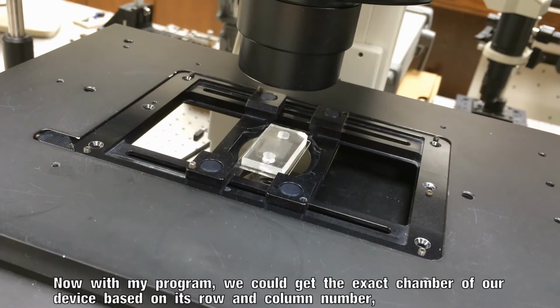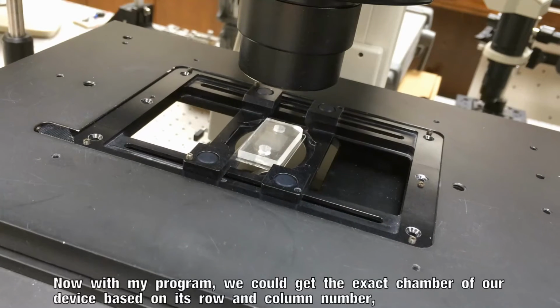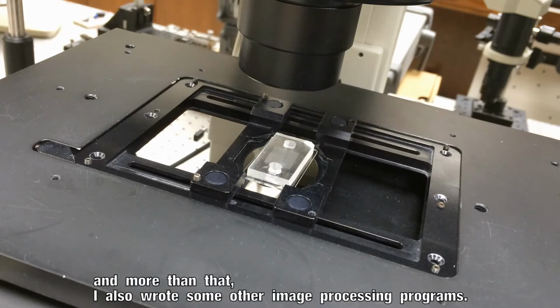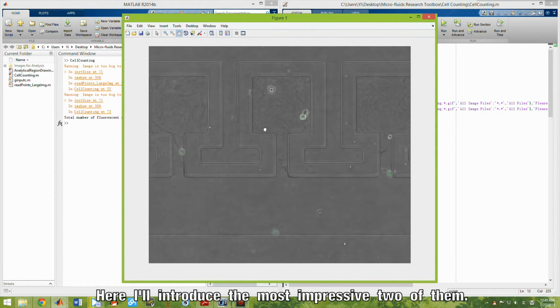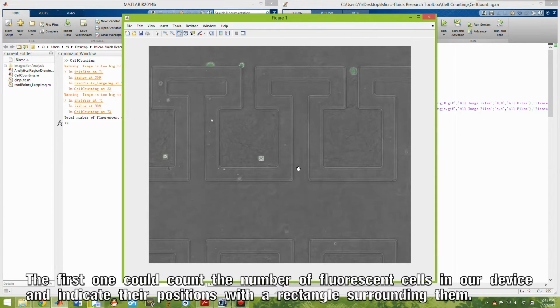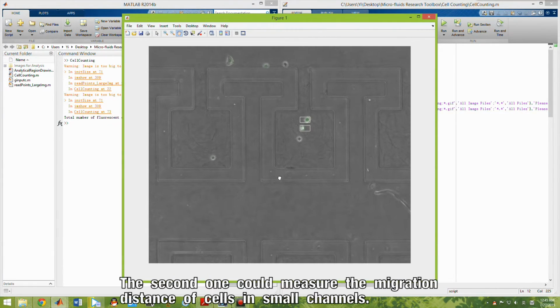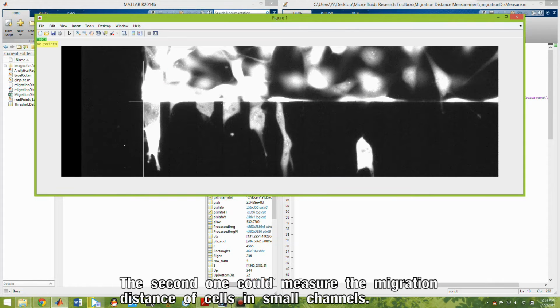Now with my program, we could get the exact chamber of our device based on its row and column number. And more than that, I also wrote some other image processing programs. Here I will introduce the most impressive two of them. The first one could count the number of fluorescent cells in our device and indicate their positions with a rectangle surrounding them. The second one could measure the migration distance of cells in small channels.